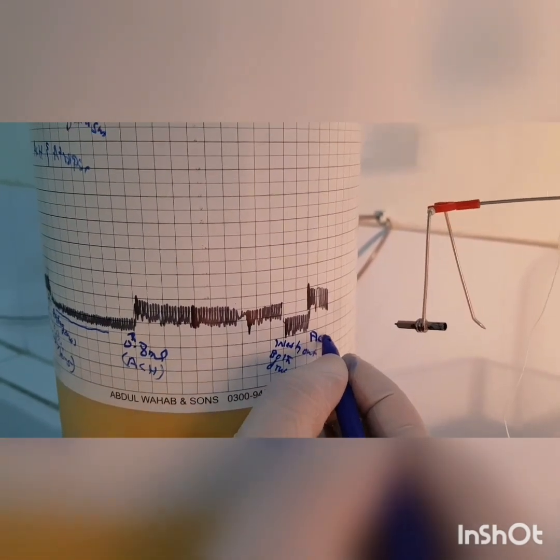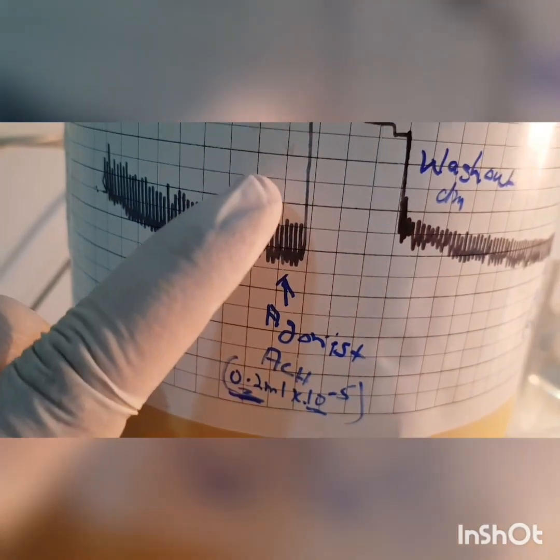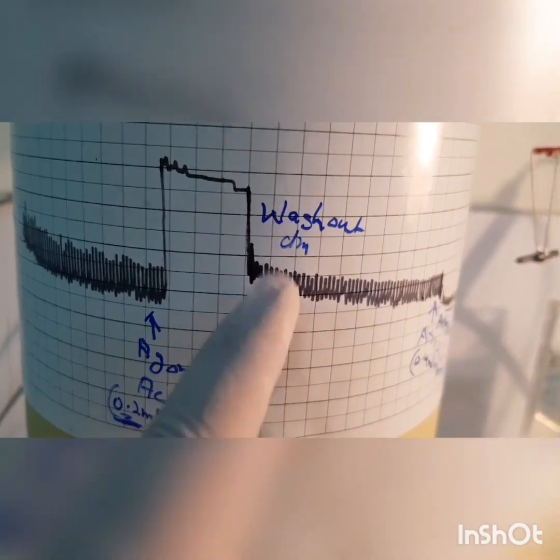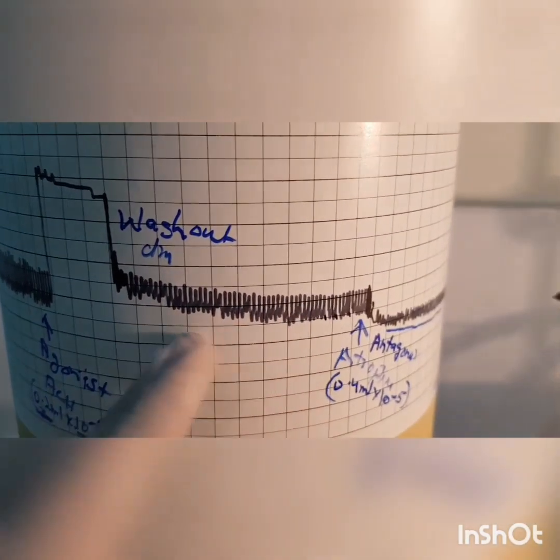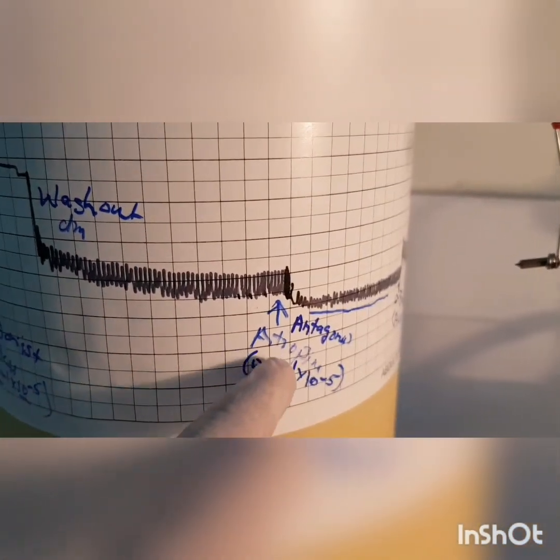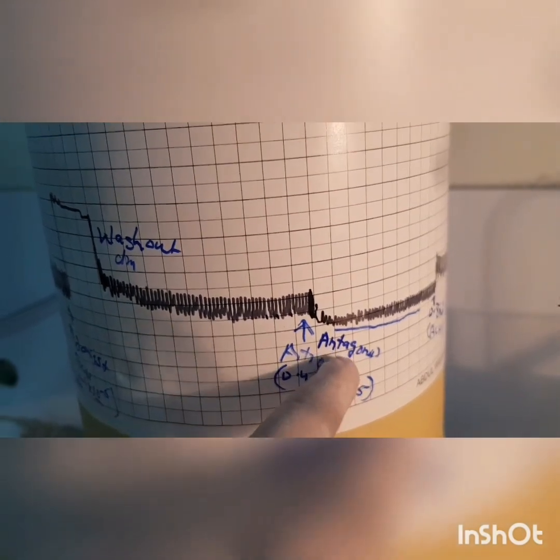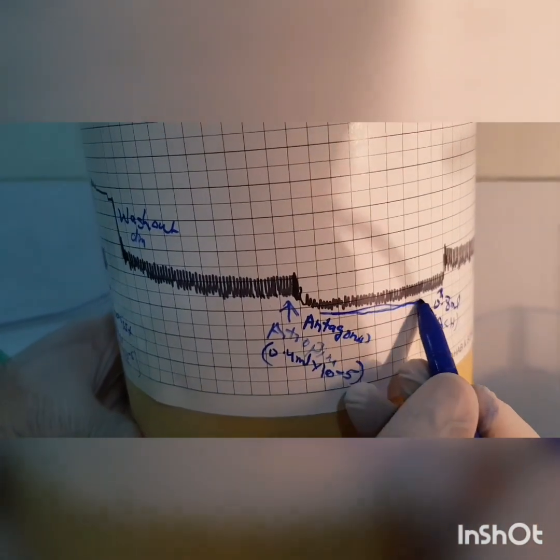Here we give again the agonist, which is acetylcholine. Again, first we give the agonist, which increases the contraction, 0.2 ml. Then we wash out the drug. Again the normal contraction. Then we give 0.4 ml of atropine, which is antagonist. The atropine will bind to the muscarinic receptor and show its effect.